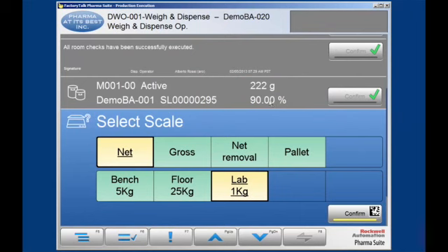Again, the operator sees only the information relevant to the task being executed in this phase, highlighted in blue. The upper half of the phase block contains a set of weighing methods. The selected method in yellow was pre-selected by the system according to the recipe definition. The others in green are available but have not been selected.